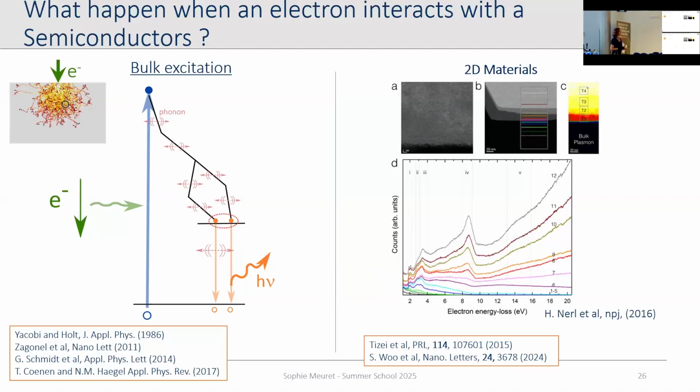Yeah, it's okay. So in radiation chemistry, usually you populate the higher excited state first, and this goes down to the ground state. That happens in most of the cases, but you still have those other things that can happen, but usually it's so small that you cannot really see it. And since we have monochromators, people are really starting to see excitons, because usually it's a much lower energy. But usually what people are looking at is this kind of excitation. And you can actually see the difference.